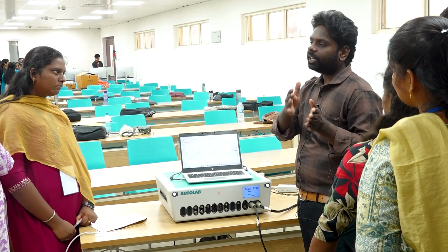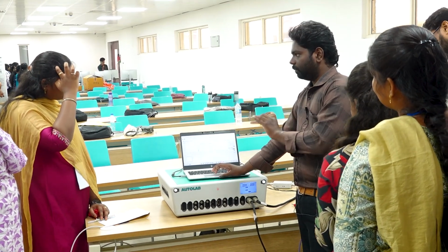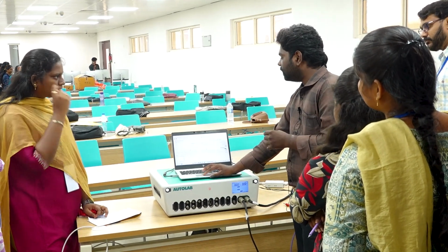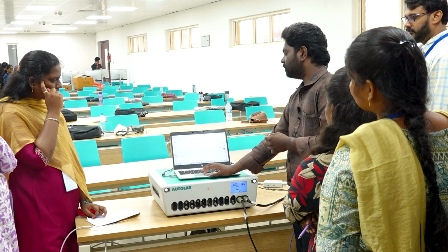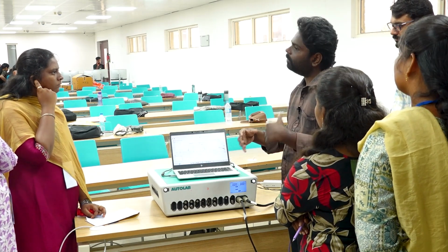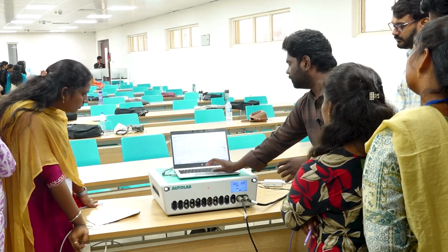Each point is denoting some parameters, right? A minimum of 3 points is required, but you can give more than 3. If it is not properly overlapping with your actual data, you can add more data points. So we have drawn this pattern.